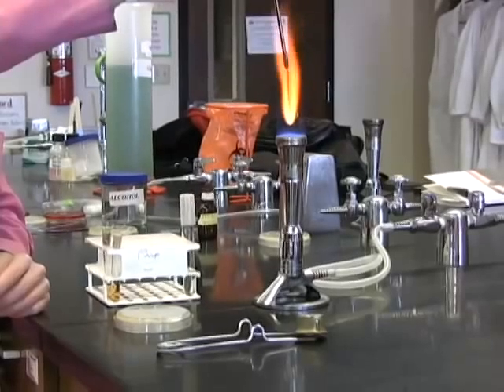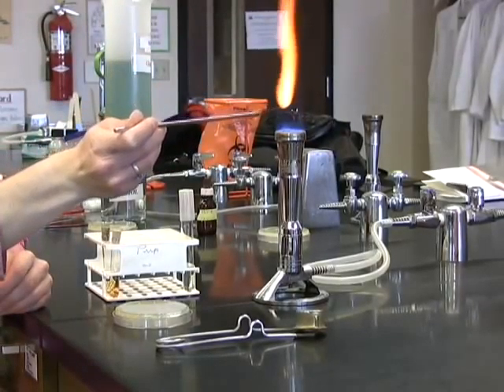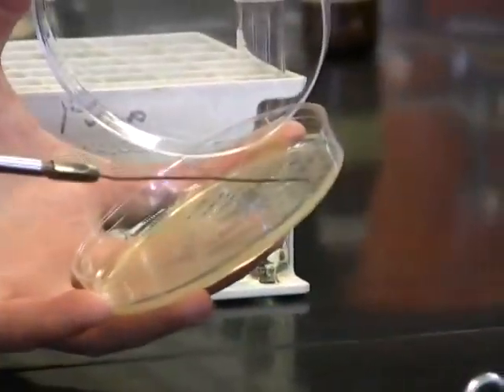In order to inoculate any tube of liquid broth, simply start with a flame sterilized loop, and as usual, take a pure culture in the form of an isolated colony, or from a reserve stock in the case of your unknown.